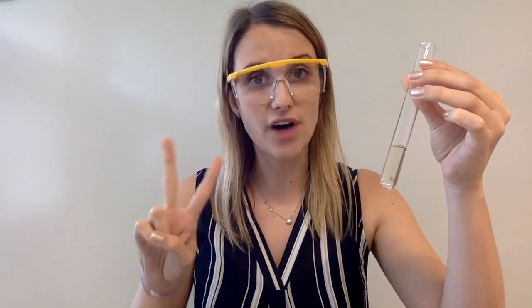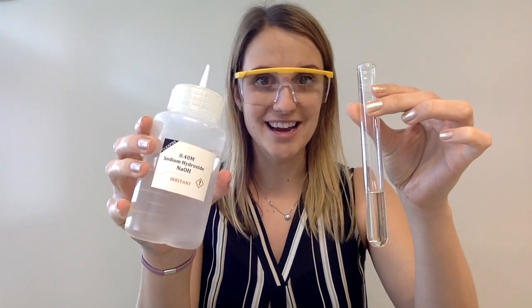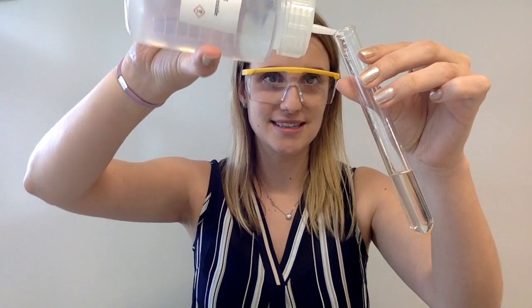So here's a sample of iron 2 ions. When I react it with sodium hydroxide, this is what you can see happening.